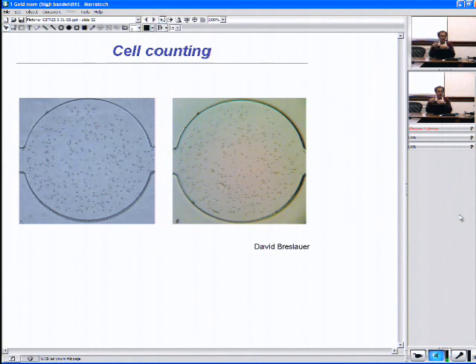different types of conditions. What Wilbur has taught us is that in cases where you're being treated for some cancers, one wants to keep careful track of blood cell counts, red, whites, and platelet counts, and the ability to have a cell counting capability on a compact system like a cell phone would be quite useful. So these are some initial attempts to demonstrate that.